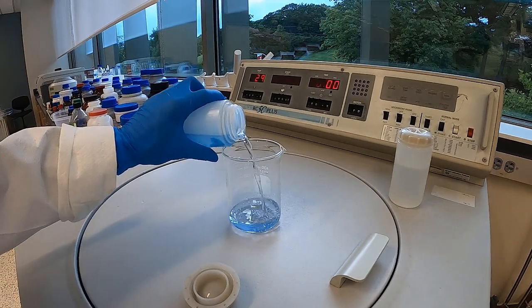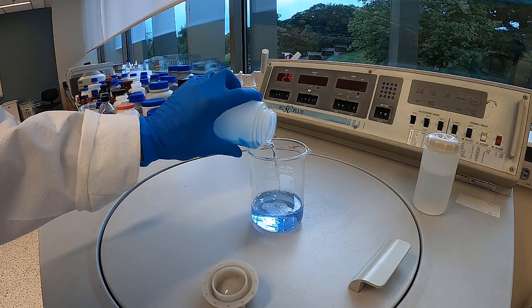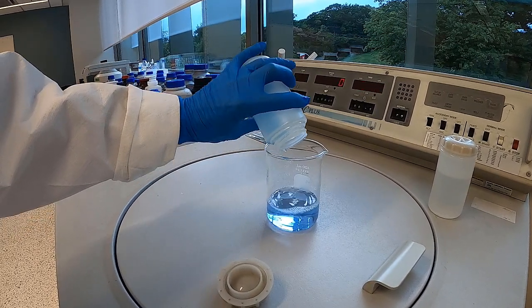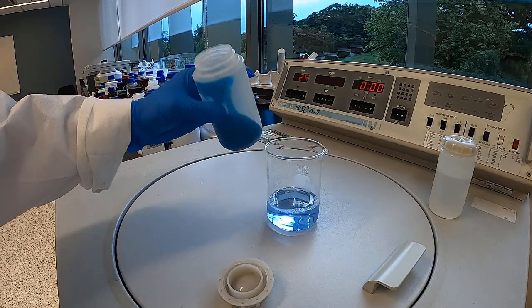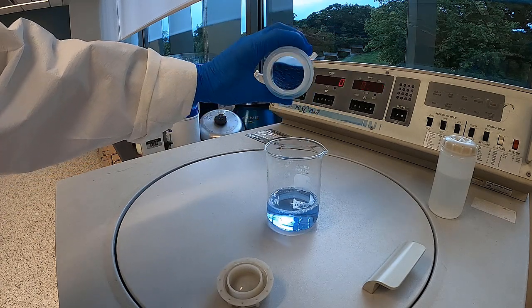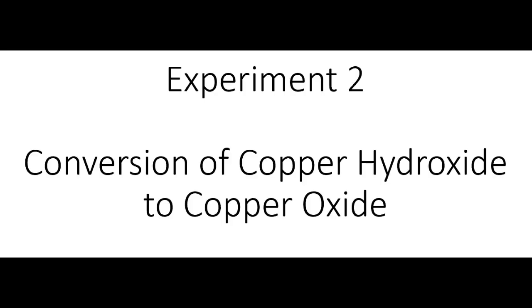Isn't that beautiful? Check it out. The solid isn't coming out, and that's just what we want right there.